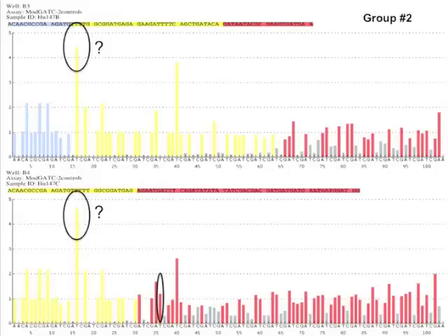The next difference is a little bit more obvious though. At dispensation 36 here, we dispensed another T there. And if we look at that same dispensation on the other pyroprint, you'll notice that there is no peak whatsoever. So in the second pyroprint, 147C here, the machine called out 1 nucleotide, 1 T there, whereas on 147B it called 0. There was no T identified by the machine. If we look at dispensation 40, we'll notice that the machine called 4 Ts in this particular location, but in the next sample, 147C, the machine actually called less than 3 nucleotides. And so that's something we would consider a major difference in the height of the peaks.